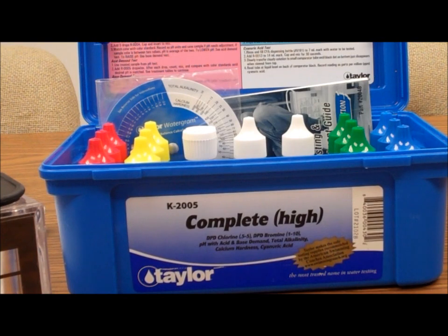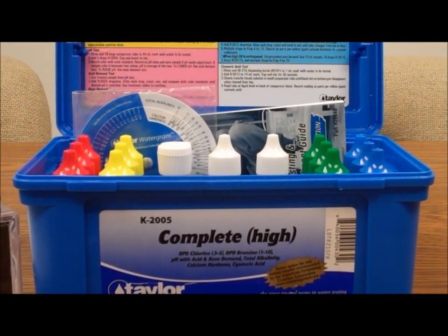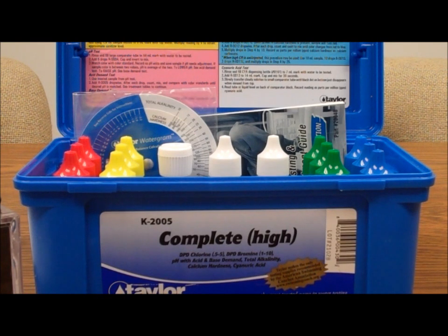It's the kit most pool professionals carry, and it's very commonly used by lifeguards at commercial facilities. This version has three-quarter ounce bottles; the K2005C comes in two-ounce bottles, with the 'C' standing for commercial. That's been our box tour of the K2005 — thank you for joining us here on poolcenter.com.